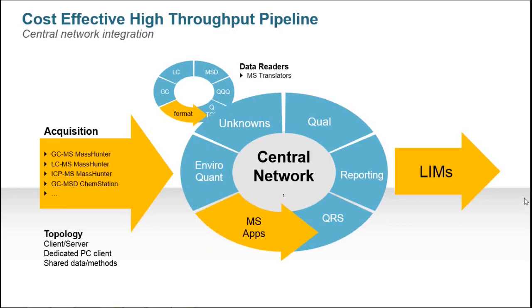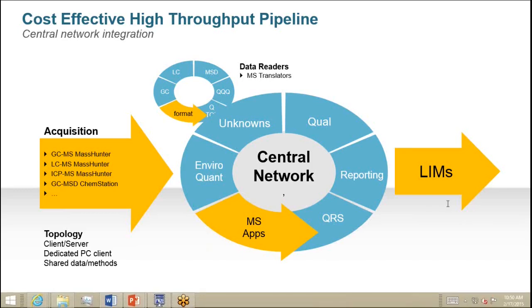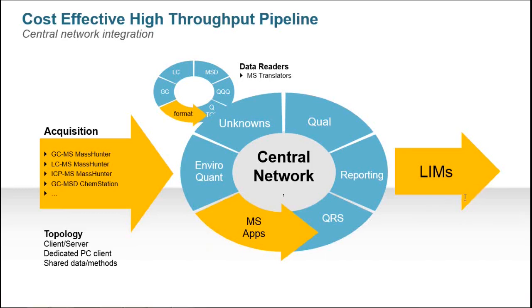Okay. Is there a compatibility matrix for Mass Hunter with existing Agilent GCMS, estimated 30% would be on XP or Windows?